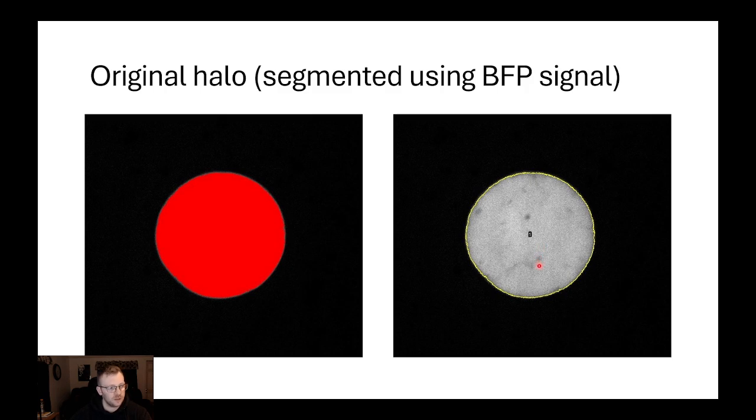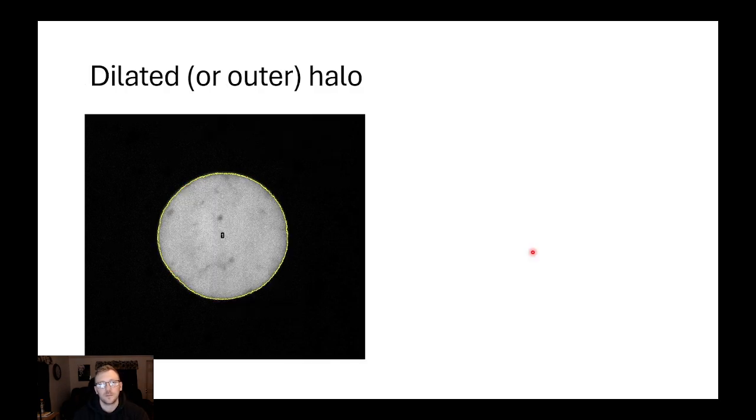Because we know we had a fluorophore there, and that fluorophore generated an electrical current that was converted into an intensity value, we can correlate the intensity of all the photons in here to an amount of proteins inside of the nucleus. We can't count 1, 2, 3, 4, 5 proteins, but we can get the collective sum of all the proteins inside the nucleus.